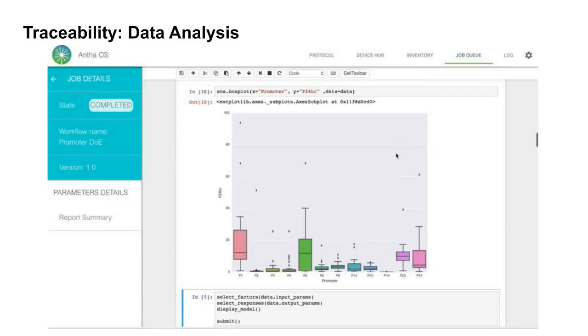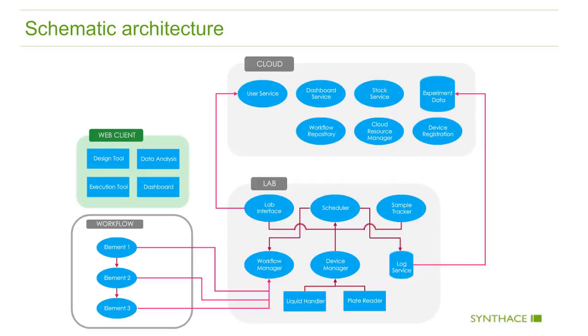Now, pulling all that off is quite a complex system under the hood. When you're actually working with Antha, these individual elements are compiling to standalone software binaries. That means that you have the flexibility of disseminating a working practice, be it a complex bioinformatics algorithm or just simply a better way of transforming your bog standard E. coli cell line, either as a closed source piece of software or as open source. Obviously, I do prefer the open source model, but it is important to allow many different ways of working with this system to evolve.